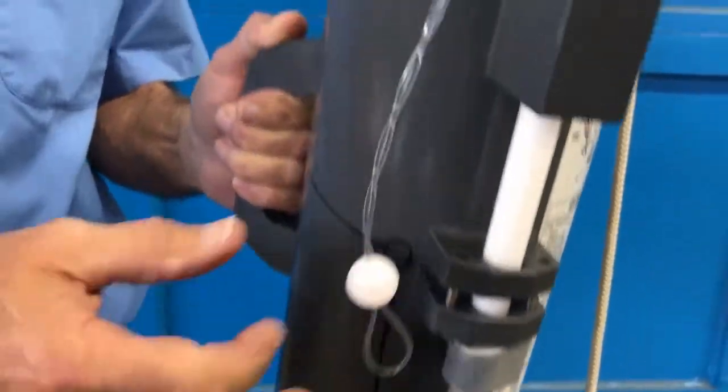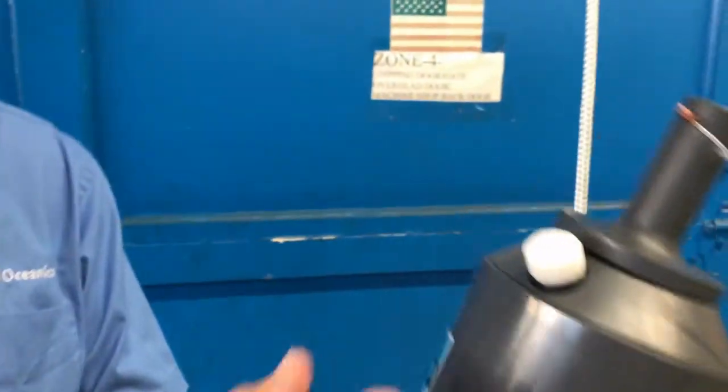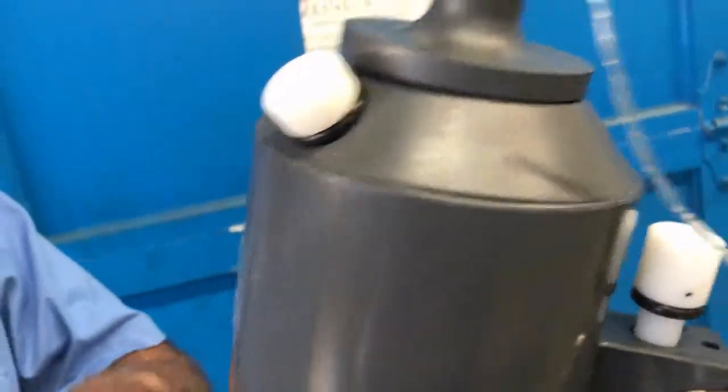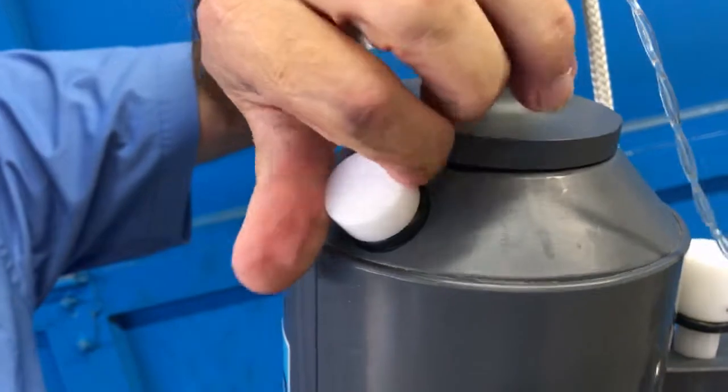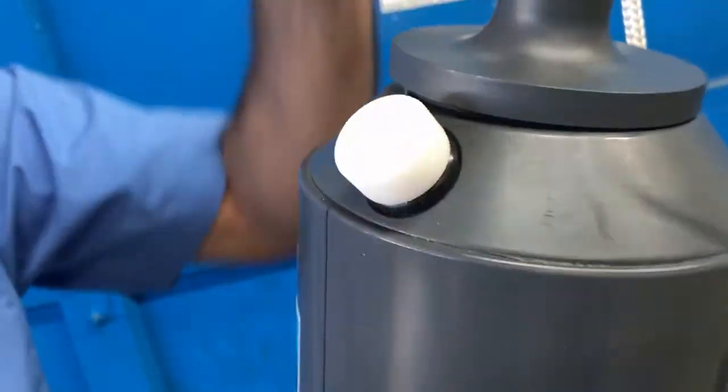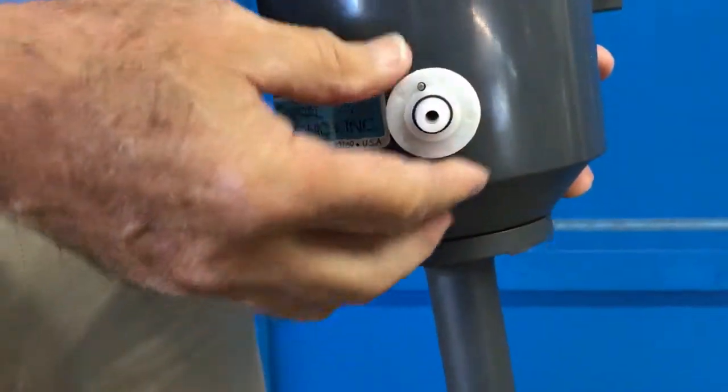An air vent screw with an o-ring is mounted near the top of the bottle. The air vent is made of delrin and a petcock, also made of delrin, is mounted near the bottom for drainage.